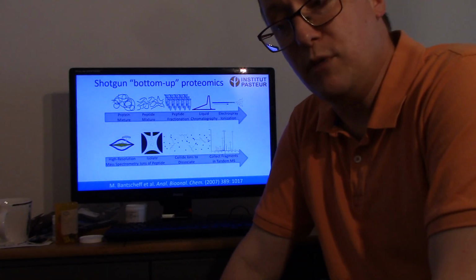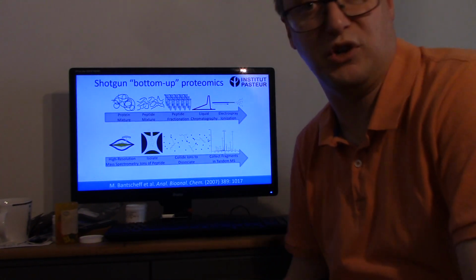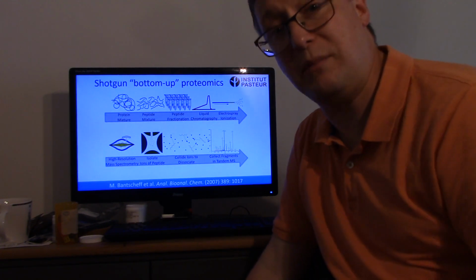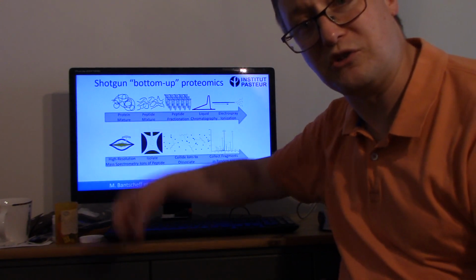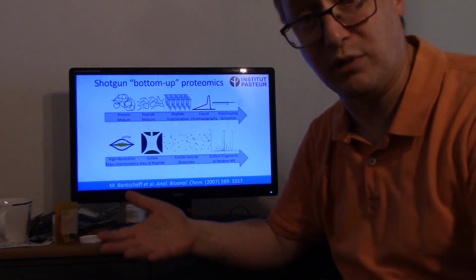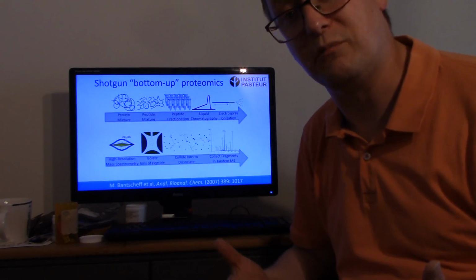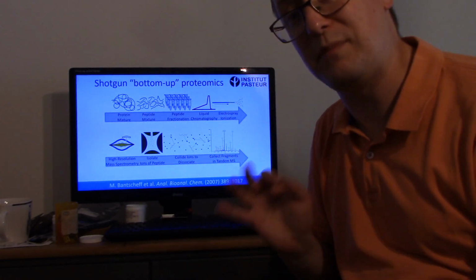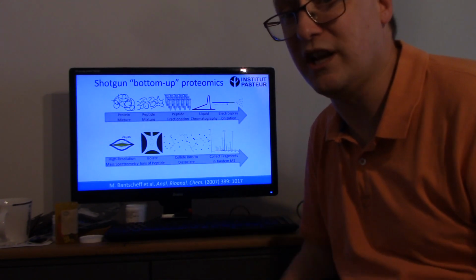First off, most proteomics laboratories today make use of a bottom-up or shotgun technique for producing tandem mass spectra to represent the peptides in a complex mixture. But typically, biologists are not starting with a mixture of peptides, they're starting with proteins. So if you have 10,000 proteins in a sample, you probably will end up digesting it to produce an even more complex mixture of peptides. The reason for this is that peptides are a lot easier to separate, a lot easier to fragment, and a lot easier to identify in the end.